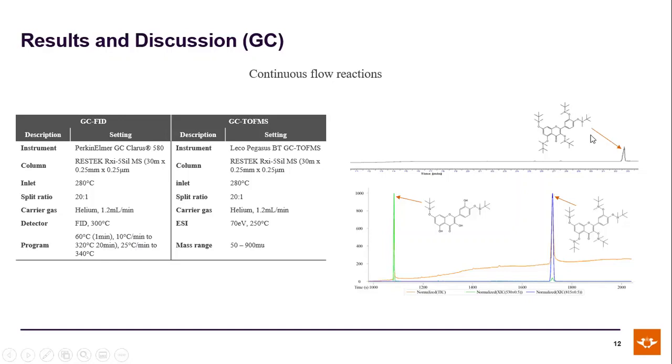This was further investigated on the mass spec, which showed that at about 28 to 30 minutes, the peak that we see belongs to quercetin that has been derivatized at least 5 times. Due to its high sensitivity compared to FID, another peak that contains at least about 2 silyl groups was observed at about 18 minutes. We further investigated this using FTIR.